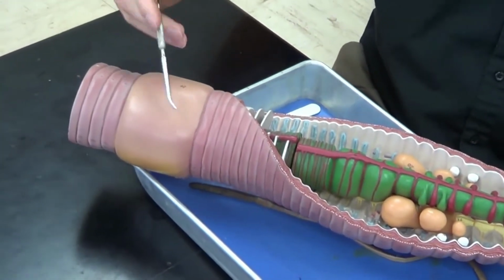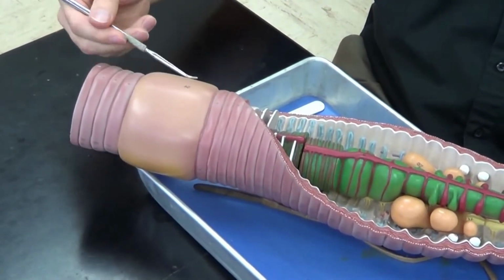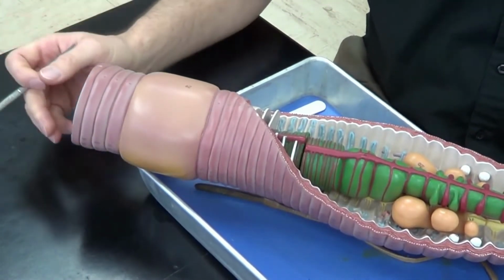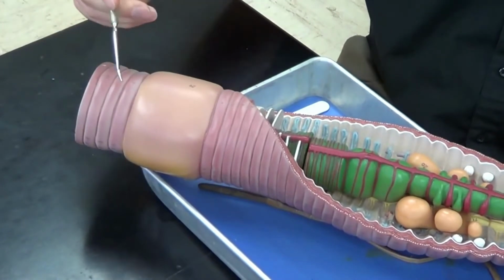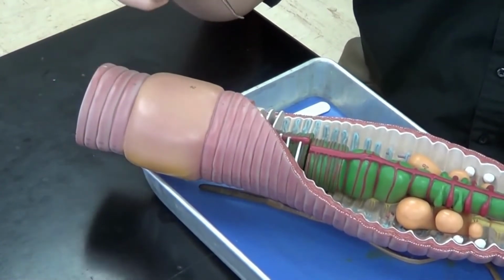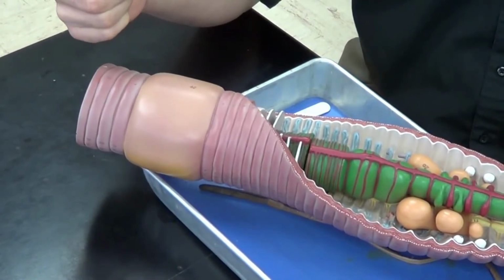Now, keeping with that thought, we've got another large prominent structure here on the external surface of the earthworm. You can see this band of tissue right here, and this is called the clitellum. And its job is actually to secrete like a viscous material that will eventually become the cocoon. And inside the cocoon will be the fertilized eggs.